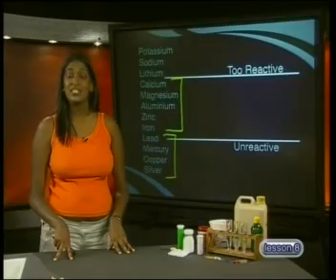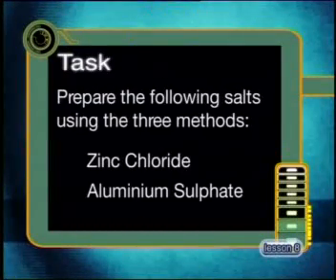Let's take a look at today's task. Prepare the following salts using the three methods: zinc chloride and aluminium sulfate.